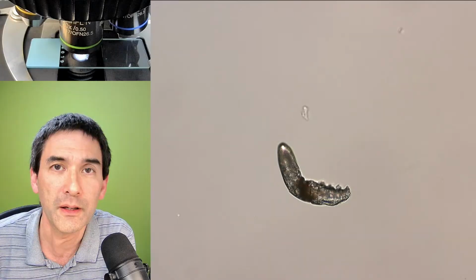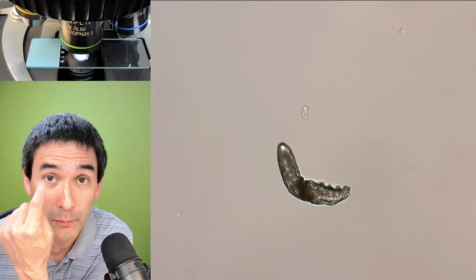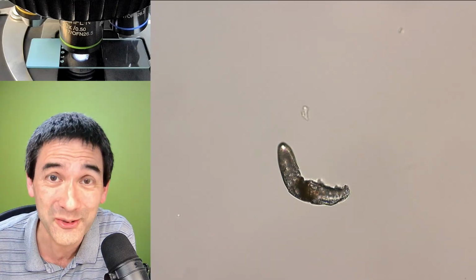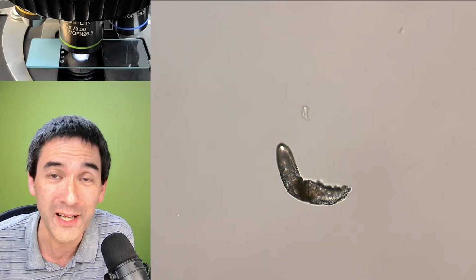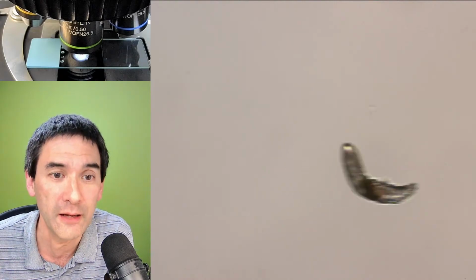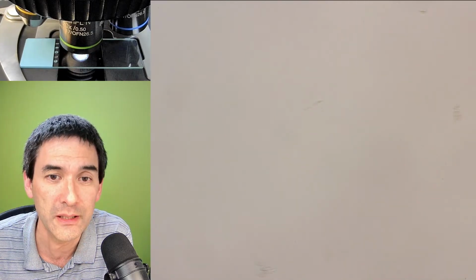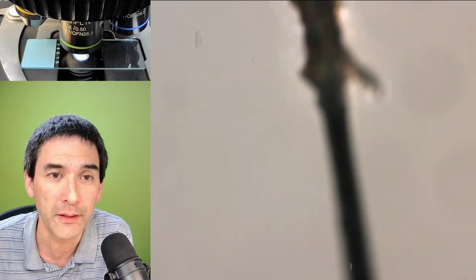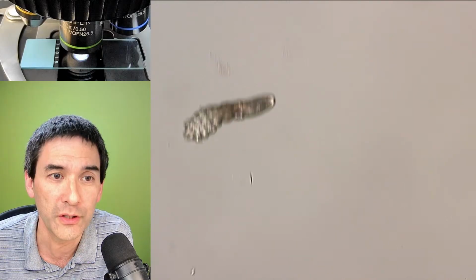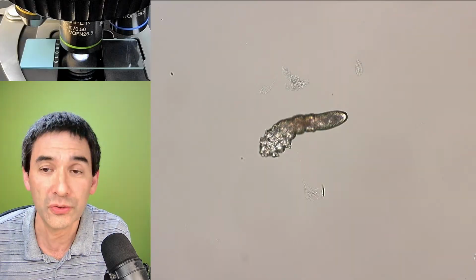Basically, I collected them one by one from my eyelashes. I'll show you how to do that today, and then I transferred them all onto one slide. And here they are. They have now been alive for a couple of hours because in preparation of this live stream, I've been preparing them. And where is the other one over here? Here it is, right? Okay. So that's basically what I'd like to do today.